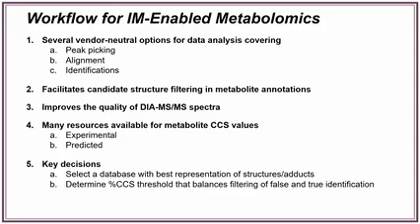And so just keep in mind that the key decisions you have to make are to select one of these databases that is the best potential representation of the types of molecules that you might see in your experiment, including the adduct types, and to balance this CCS threshold properly so that you don't cut out too many things while simultaneously keeping the right identifications there.